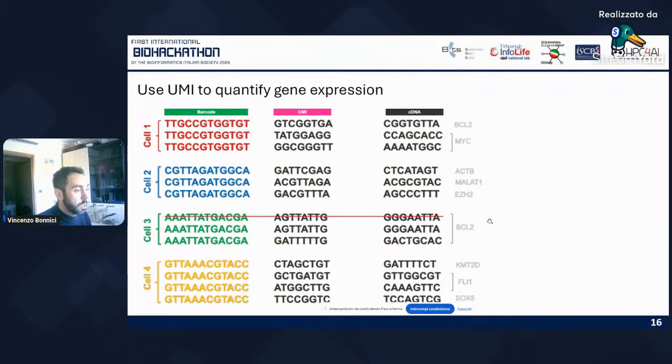So be always aware that there are a lot of errors that can be introduced in this, and also errors that can be in your data, and they are intrinsic, like sequencing errors. This can discard some of the low quality reads, but some of the reads will always have some errors.